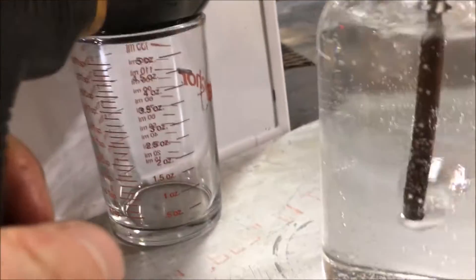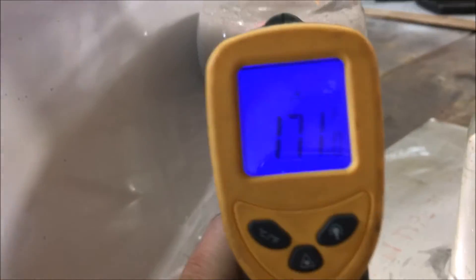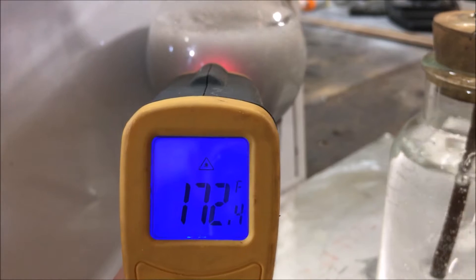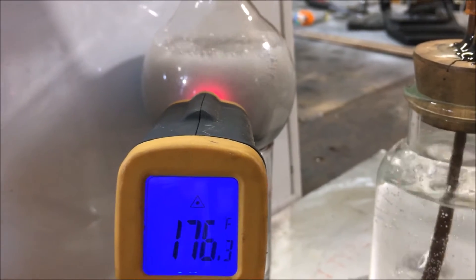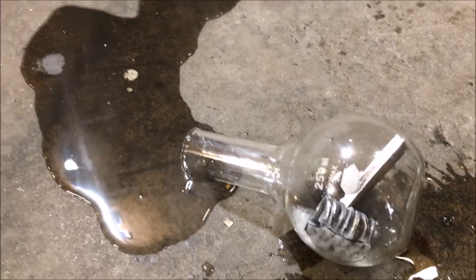That is a lot of gas production. I'm just hoping it doesn't get too hot. I'm going to have to start spray cooling this down — it's about ready to start geysing on me. I'm in a bit of trouble here. I need to stop right now.